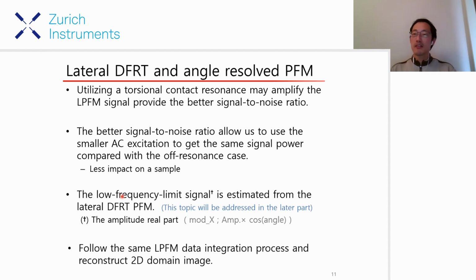If I work just in-plane, then the calibration factor is all the same. But if I want to address the out-of-plane, then even though our photodetector gives the vertical deflection and the in-plane torsion signal, the lateral and vertical signals give you values on a millivolt scale, but that does not guarantee that the actual physical dimensions of the piezo response are the same.